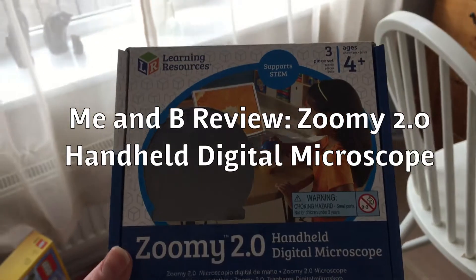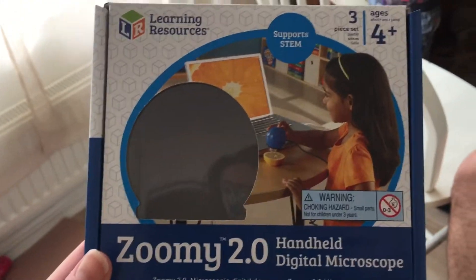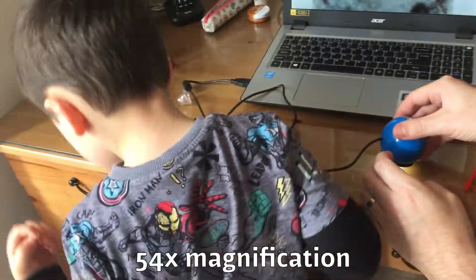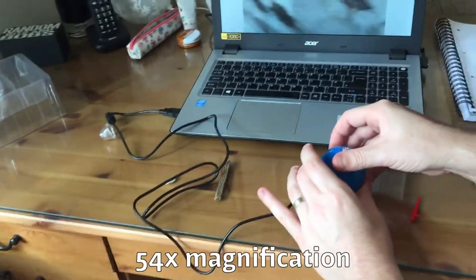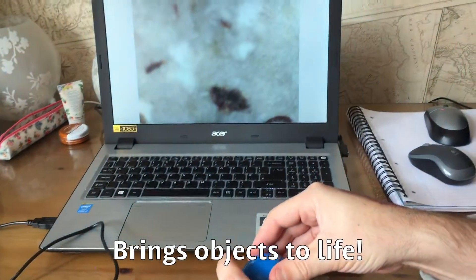Hi everyone and welcome to this me and Bea review of the Zoomy handheld digital microscope. We've just been playing around — here's Brandon and daddy. We just dropped our fossil on there, Brandon.